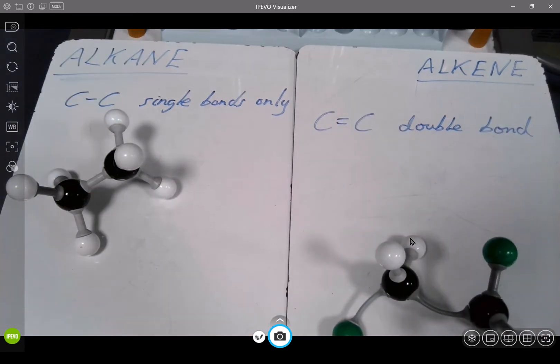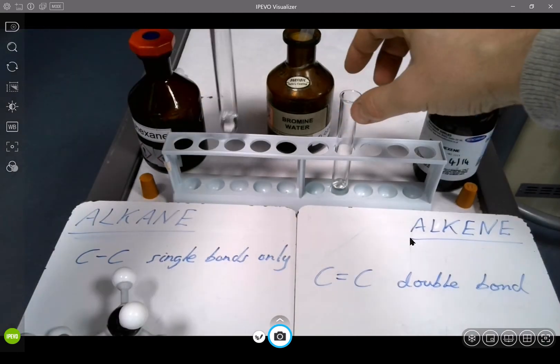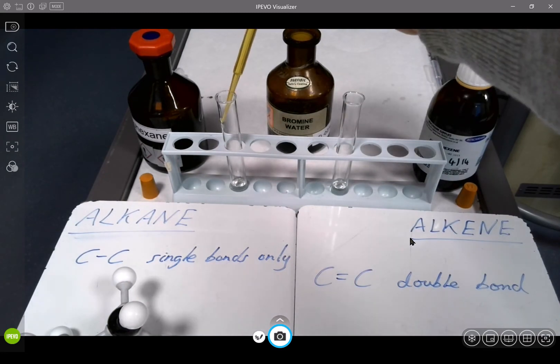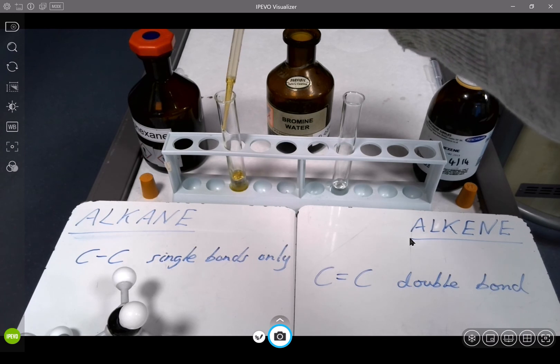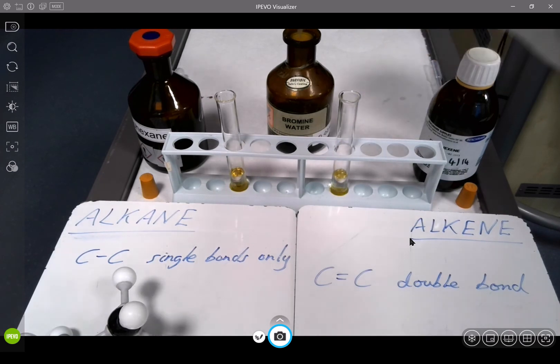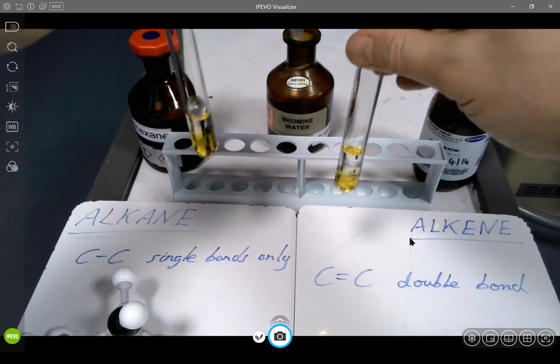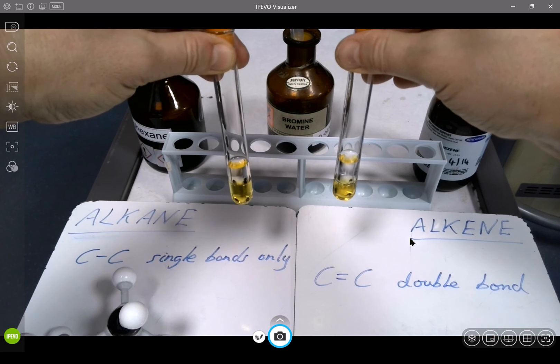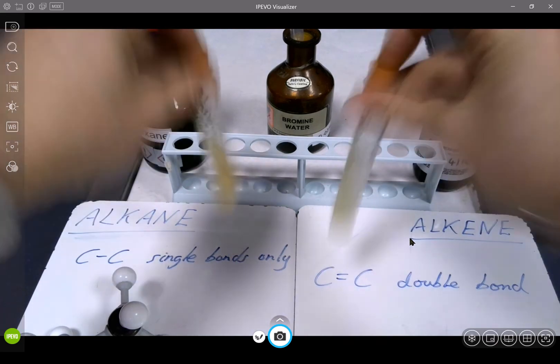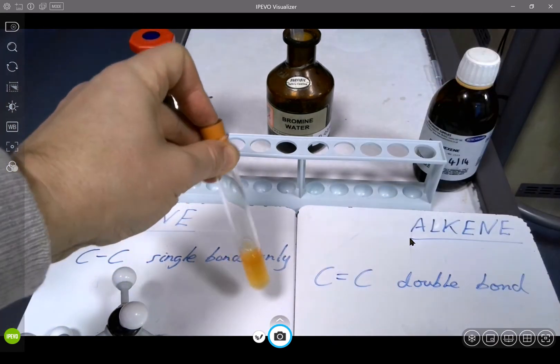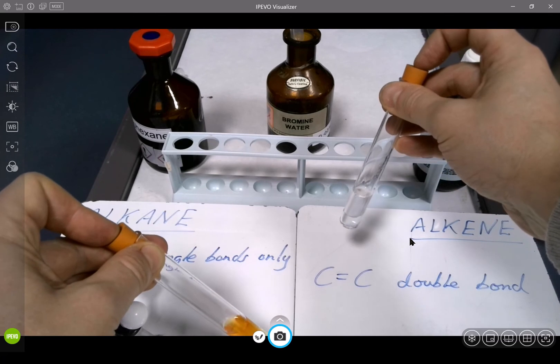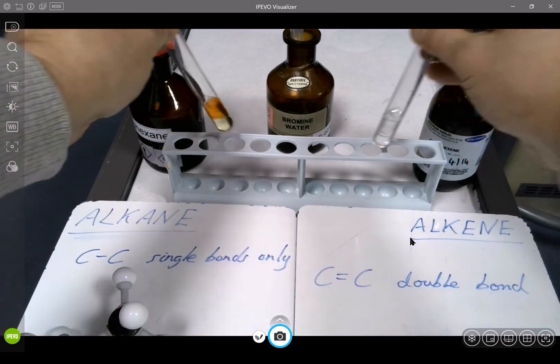Let's see that in action. So there you go — my alkane over there and my alkene over here, colourless liquids. I'm going to add bromine water to each. Bromine going into one, and then bromine into the other. Now it should look the same at the moment until I give it a shake. Notice the bromine water is more dense so it sinks to the bottom, and the alkane and alkene are both less dense so they float to the top. Give it a shake — three, two, one. And there we go. With the alkane, no reaction, because that carbon-carbon single bond is very strong. And with the alkene, we have a reaction — the colour goes orange to colourless, because the double bond is reactive.